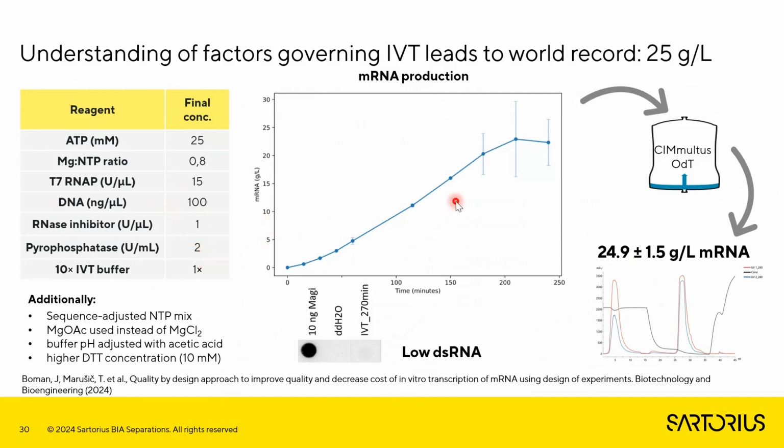And gratifyingly, the reaction went all the way up to 25 gram per liter, taking us into an unprecedented high yield environment, also with completely different cost efficiency, which now needs to be further explored because it's quite attractive.